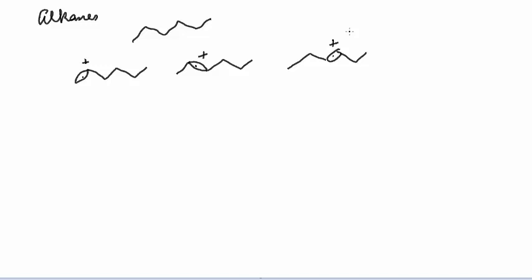Alright, what's going to happen is that the radical cation, when it fragments, is going to fragment to a neutral radical and a non-radical cation. And so let's see that for each of these. Here, the most favorable result will be to have it break up into a methyl radical and a 5-carbon primary cation. Basically, the one odd electron here is shifting towards the end carbon.